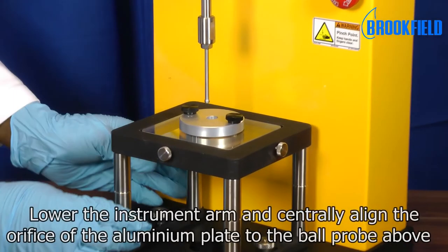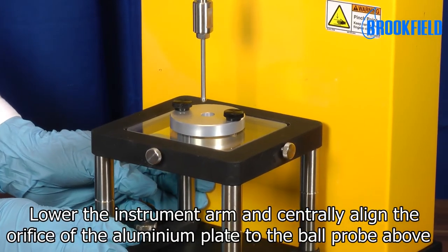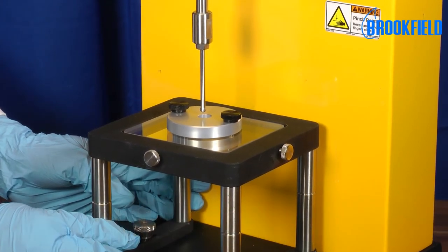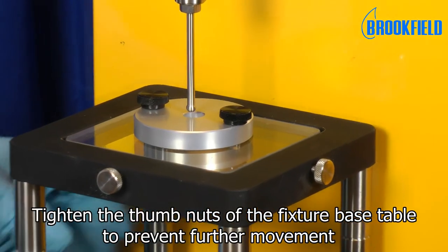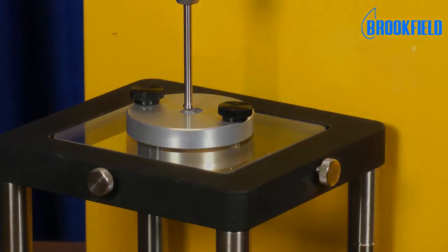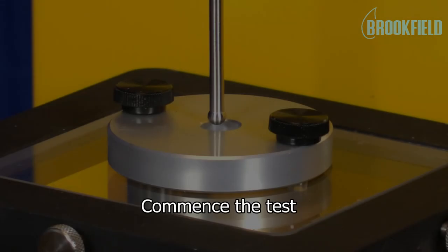Lower the instrument arm and centrally align the orifice of the aluminum plate to the ball probe above. Once alignment is complete, tighten the thumb nuts of the fixture base table to prevent further movement. The test can now begin.